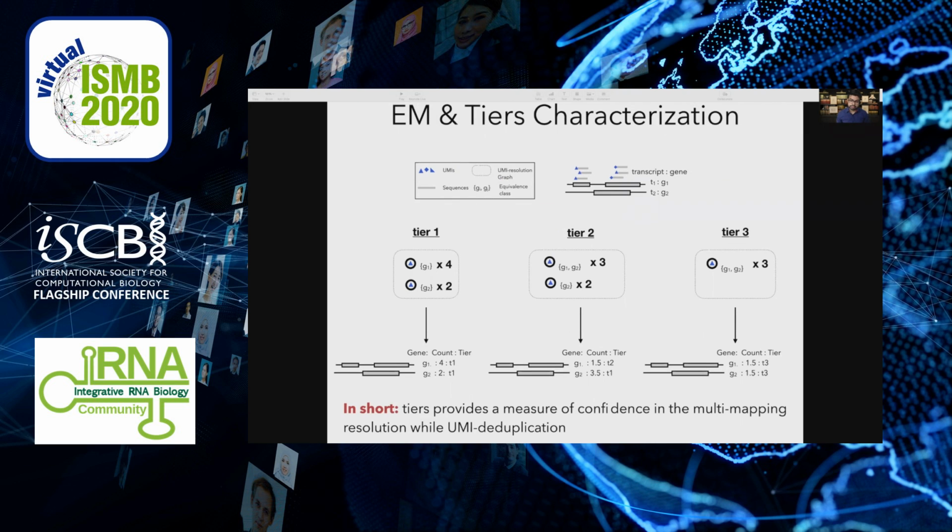The parsimony-based condition of Alevin adjudicates the multi-mapping problem in a direct way by finding the simplest solution to the problem. However, it's still possible to have multi-mapping reads even after the resolution, and we solve it by using the expectation maximization algorithm.